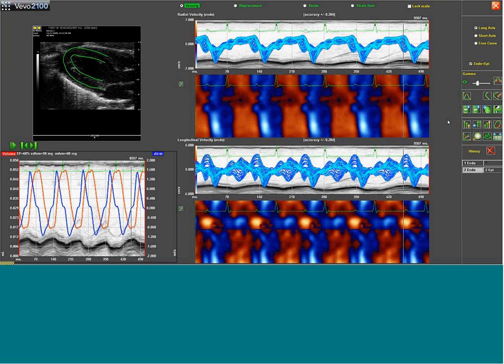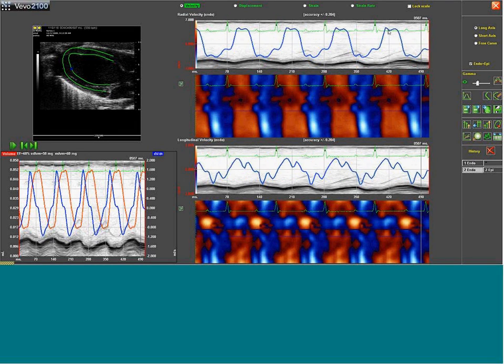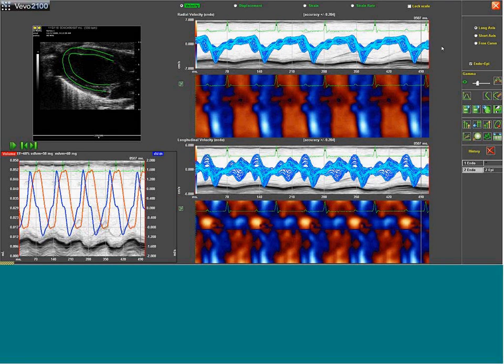The computer that's inside the imaging station is dedicated really to driving the boards and actually doing image acquisition. And the specifications on it are a little bit lower than they might be for, say, current laptops and current desktops. So the amount of processing that VevoStrain requires does tend to work better on a modern desktop or a laptop.